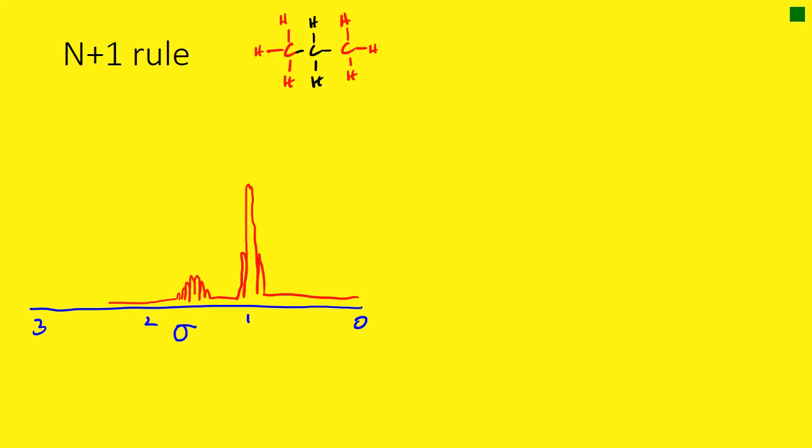Okay, so let's put our integration values on. You might even see this written with an integral sign here with a 6 and an integral sign over this peak as a 2. It could actually be 3 and 1, right? You might see 3 and 1 there. The ratios are the same. Let's have a look at our peaks here in slightly more detail.